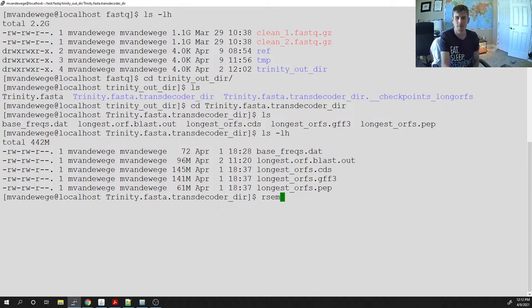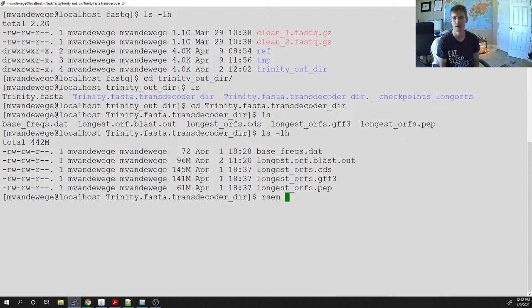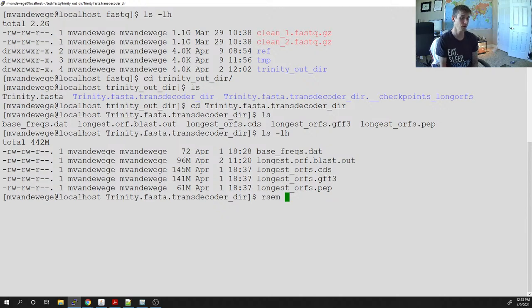The mapper can be STAR or BWA, which are common mappers, but RSEM by default will use an older mapper called Bowtie. I don't seem to run across any problems using the default parameters of RSEM. I think BWA is a better mapper, but RSEM is optimized for specific Bowtie parameters, so I just leave it at that.